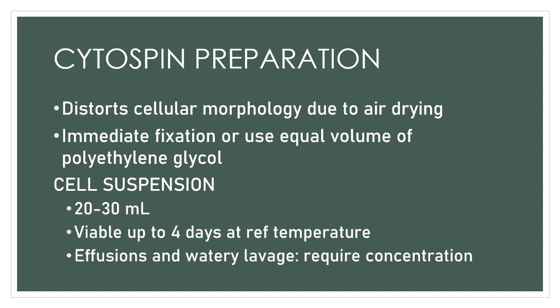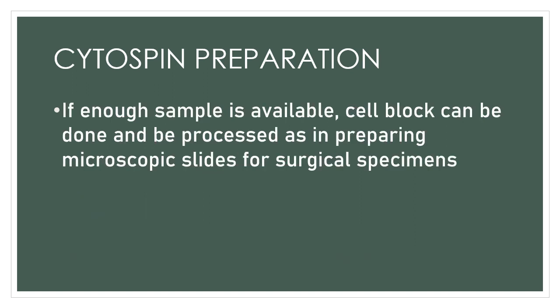Okay, so centrifugation. In the case of effusions, where your sample is an effusion and you have your watery lavage, you concentrate it using a centrifuge. Still, if enough sample is available, a cell block can be done and processed as in processing microscopic slides for surgical specimens.